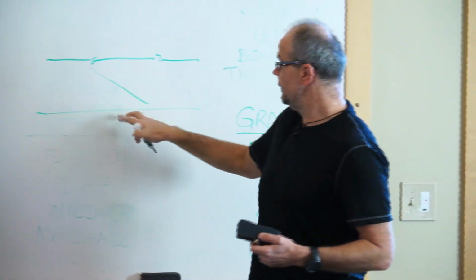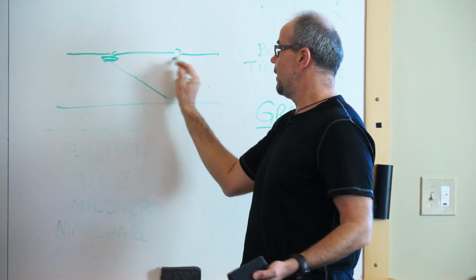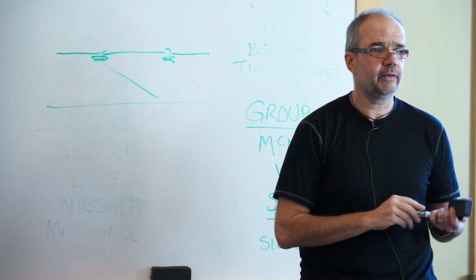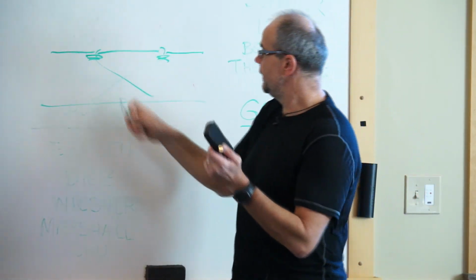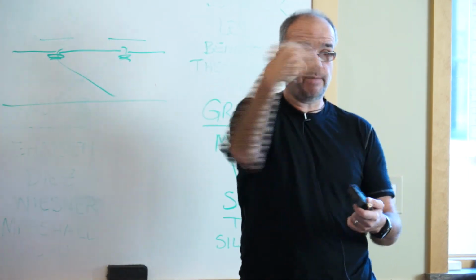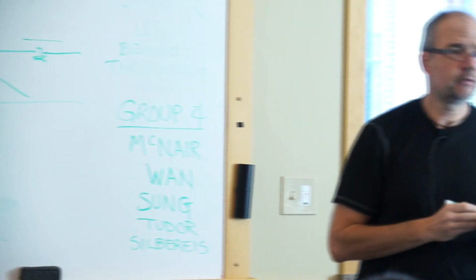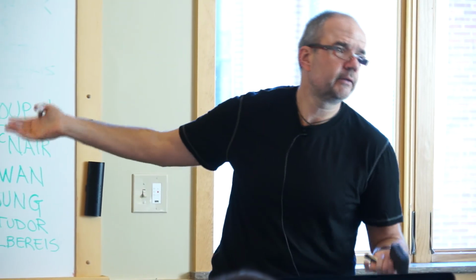The middle part is no different. The only thing that's different is around the insertion sites, what's called the event boundaries or breakpoints. So it will create a contig around here and around there that's unique to this sample, and then you can map it back, and that's how you characterize it. That's an inversion. It really just detects what's different first, and then you have to characterize it afterwards.